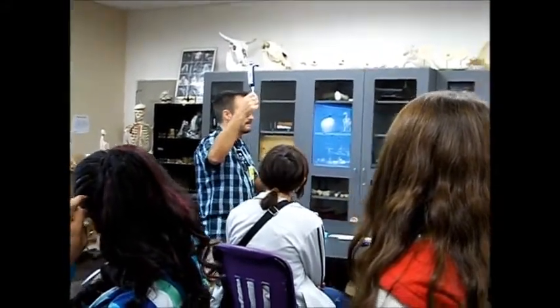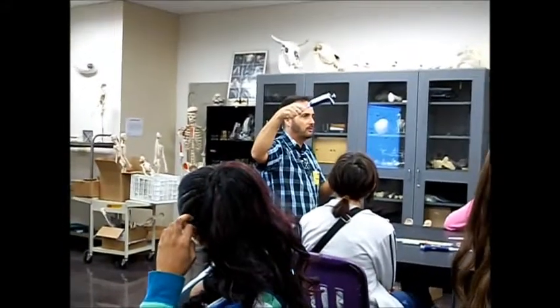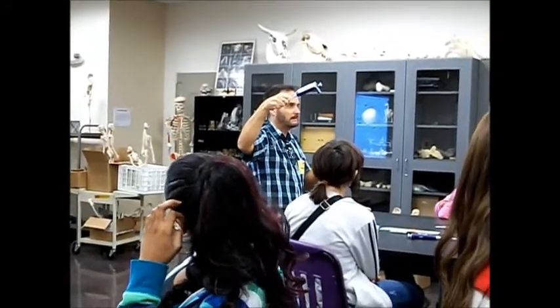So you've got to get 250 in each one. Can these things measure 250? No, this one only goes from 20 up to 200, so how could you do that?